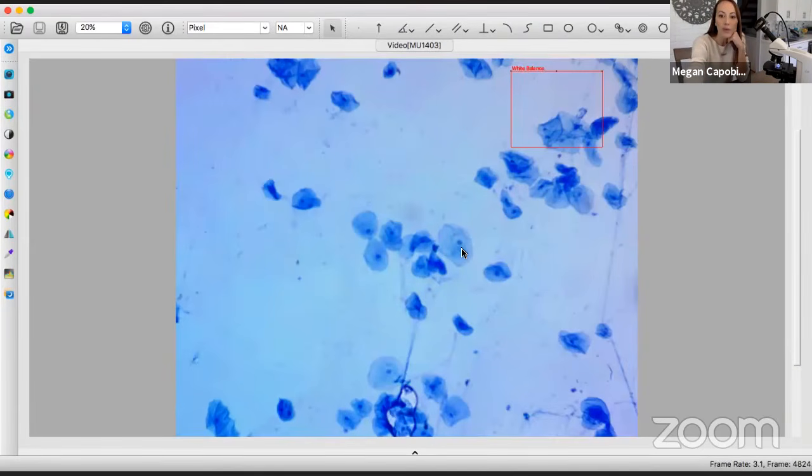However, what are we noticing that is also in the center of all of my cheek cells? What is that dot? It's the same thing it was on our plant cell because we are also eukaryotic. So that is going to be the nucleus. So we are able to see where my DNA is kept within these cheek cells. All right, awesome. I'm going to stop sharing.